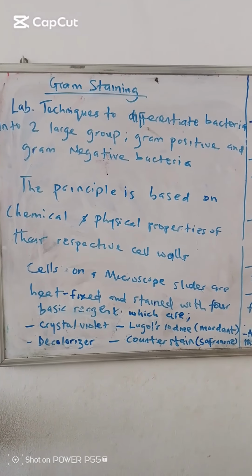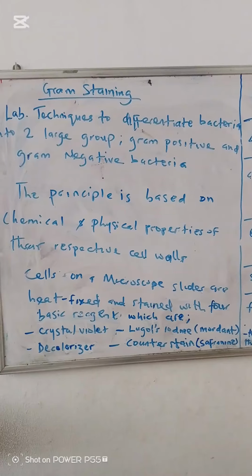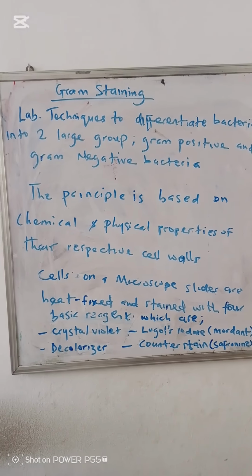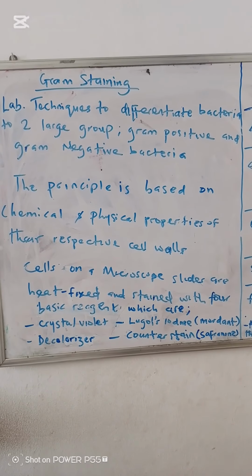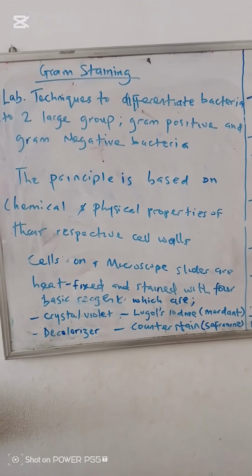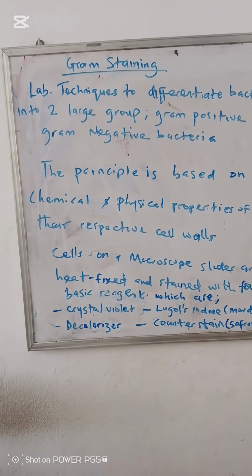Today we're going to be talking about gram staining. Gram staining is a laboratory technique used to differentiate bacteria into two large groups, mainly gram-positive and gram-negative bacteria. The principle of this gram staining is based on chemical and physical properties of the cell wall.